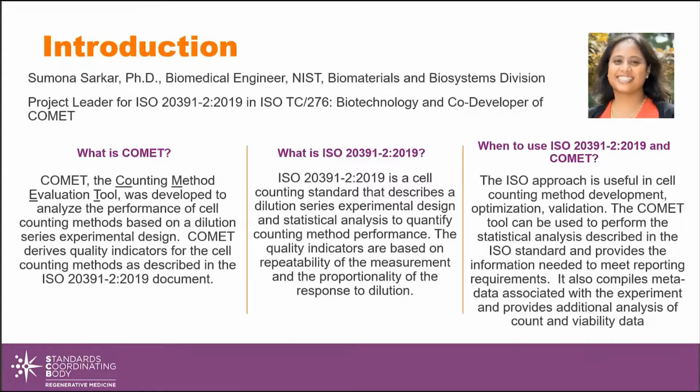So COMET stands for Counting Method Evaluation Tool. And as I said, it was developed to analyze the performance of cell counting methods based on a dilution series experimental design. This tool calculates the quality indicators for cell counting methods that are described in this standard. So this standard outlines a dilution series experimental design and statistical analysis approach to actually quantify the performance of a counting method and eventually compare the performance of counting methods.